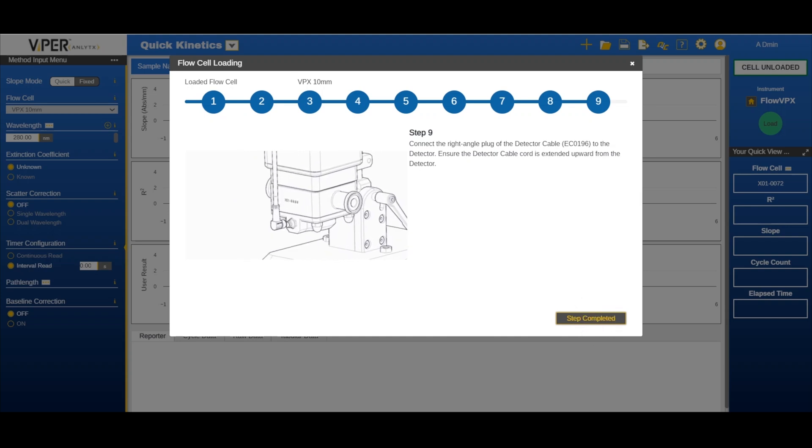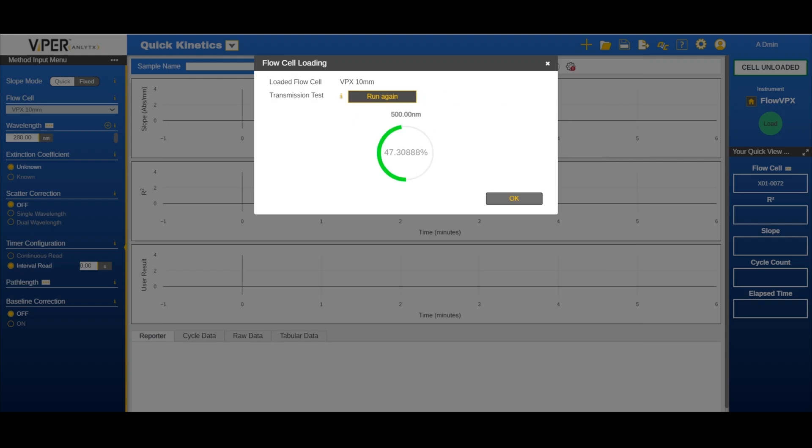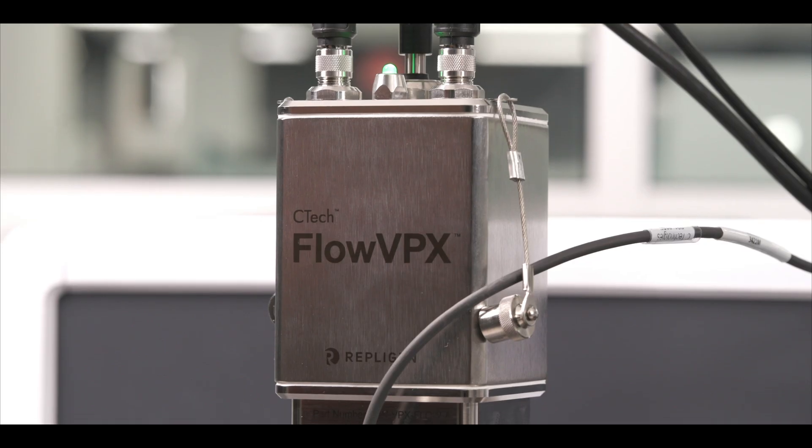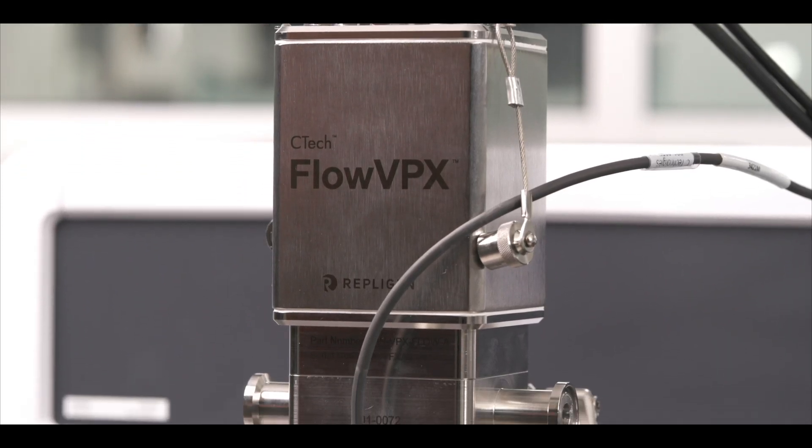The FlowVPX system will now collect your transmission test results, then display them on the screen. Once the check is successfully completed, click OK. If the transmission check fails, refer to our general troubleshooting video. Congratulations, you now have successfully loaded the flow cell.